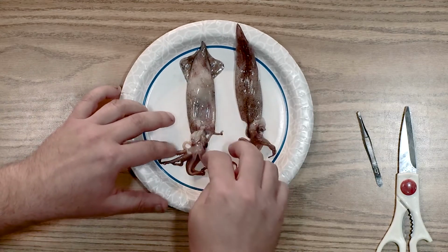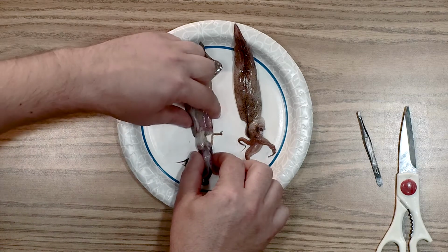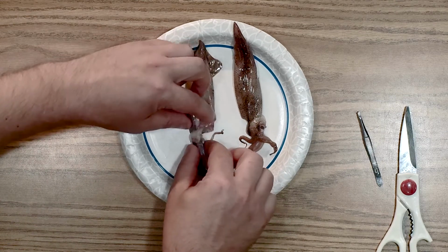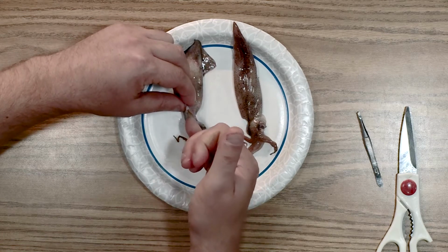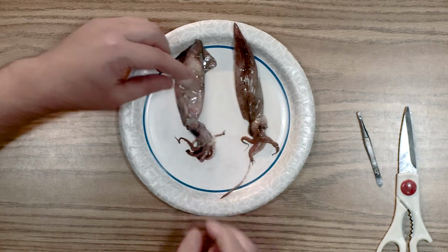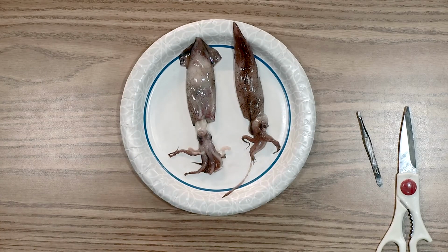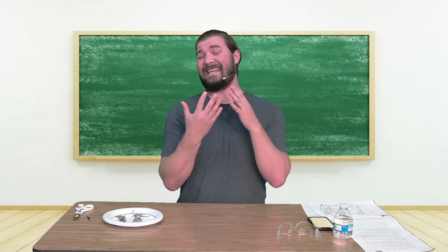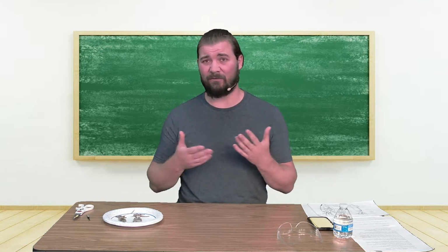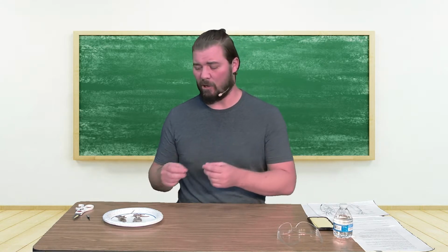As we continue down, you'll see that it's not specifically connected or sealed here. There's actually openings here to where I could like put my finger up inside the squid right away. Now, that means when this squid is swimming around in the water, water can get up inside of that mantle and flush stuff all around. It's very different than like a closed organism. It's got those open passageways.